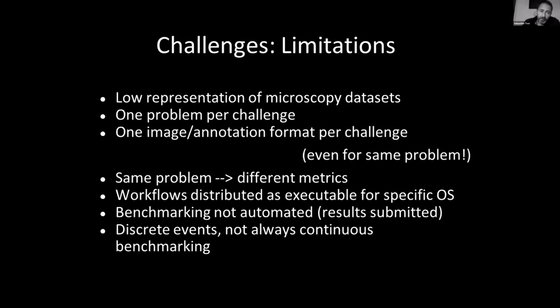And worse, for every challenge, since they are organized in an independent way, even if the challenge is on the same type of images and problem, the format of the annotation of the biological objects in the image is not always the same. So everybody has their own way or own standard. Also, for the same problem, the workflows are not always evaluated in the same way. So different metrics might be used. So it makes it difficult to compare or group.